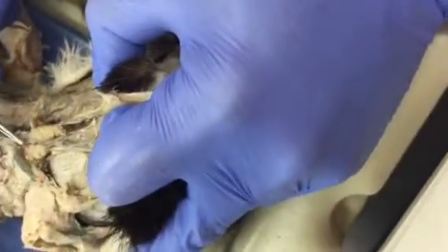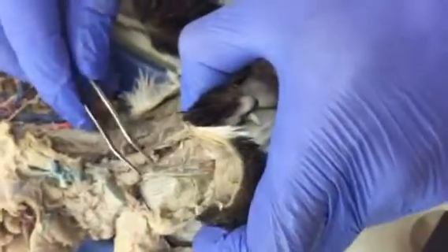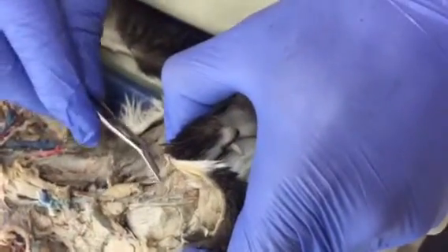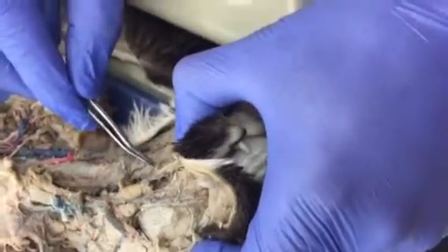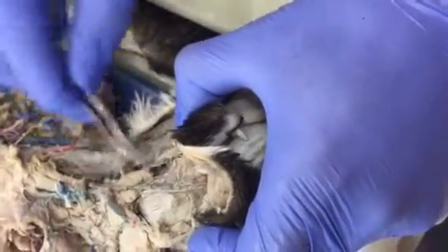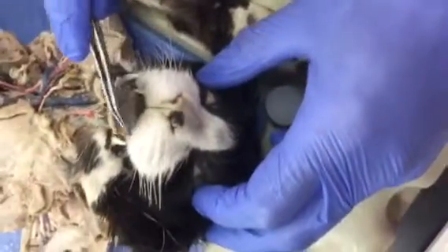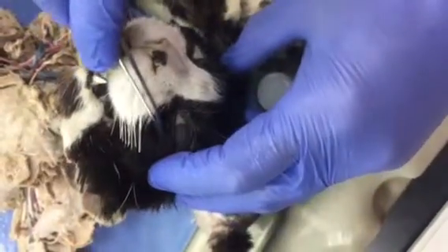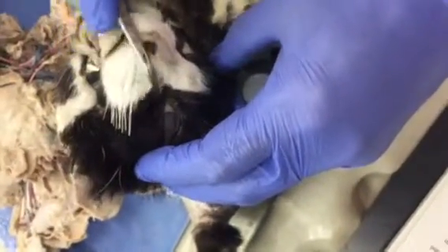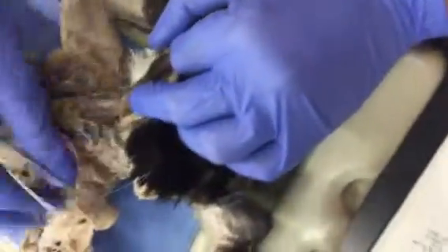Is that our linguofacial? Yep, so it becomes your lingual and then your facial. And remember, our cat has two linguals, but lingual, facial, and then into facial. And then right up here we have labial. Labial means lip, so it's going to be upper lip, and then your vena angularis oculi. Put that one down.